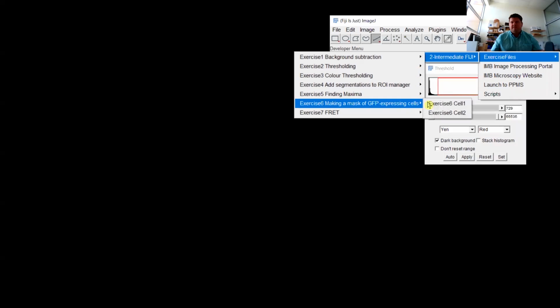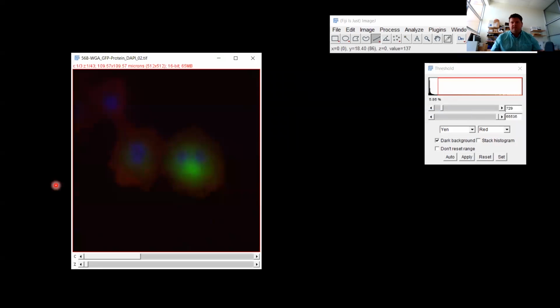And I think the other example was basically the same. Yes. So it has 2 cells that are green and ones up here that aren't. So it doesn't really matter which one you use in that scenario, but you can work through that in your own time.